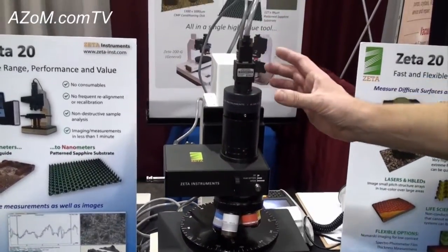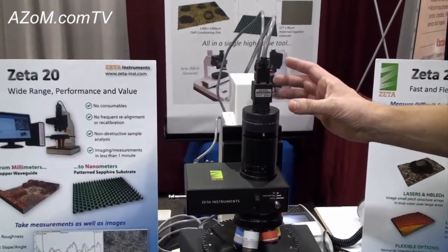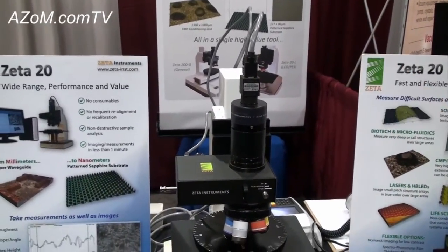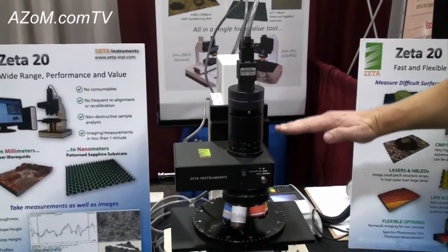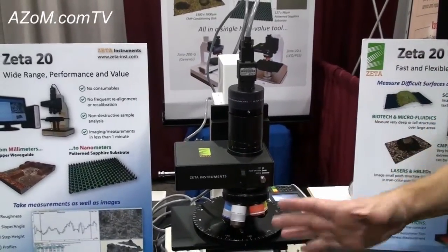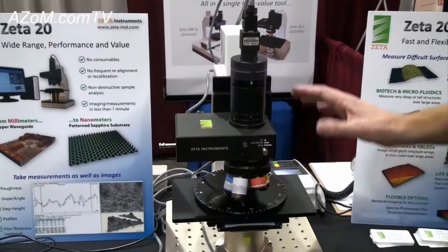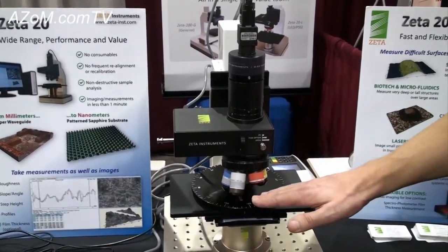Our camera coupler combination is very adjustable and user changeable to adjust to particular sampling needs by the customer. This is a mechanical drive in which we actually take image slices which are based on full field of view of the current camera coupler to the sample.